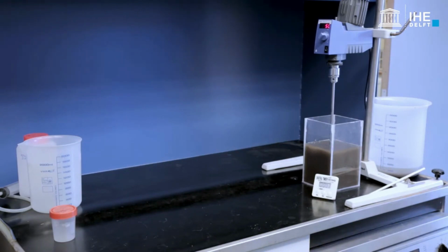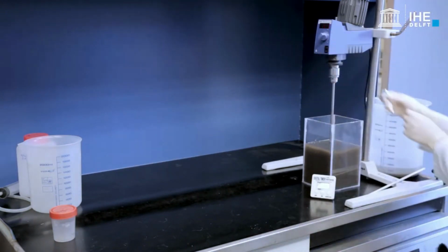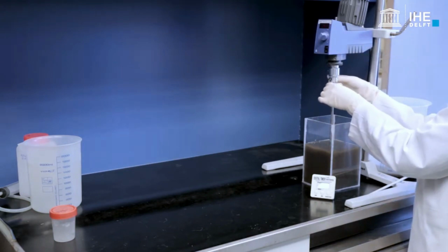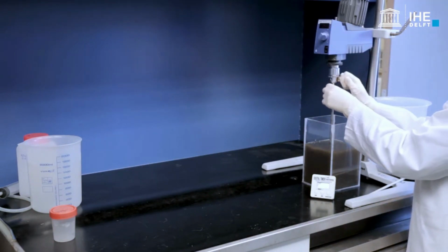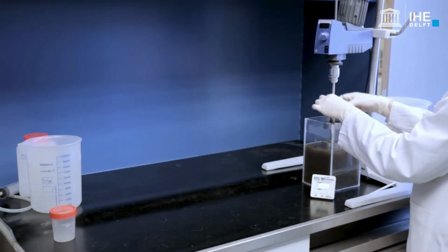After 30 minutes, turn off the mixer. Remove the mixer from the square flocculation jar and allow the sample to settle for 30 minutes.